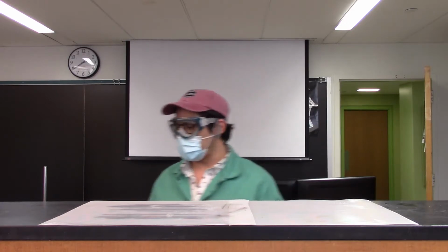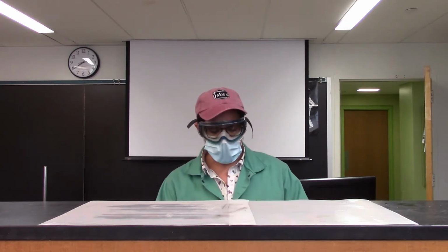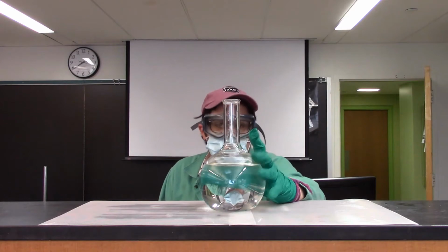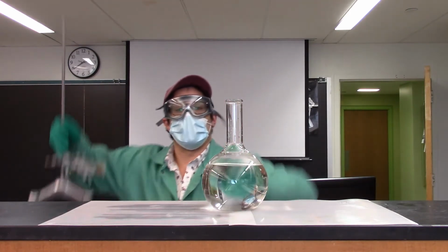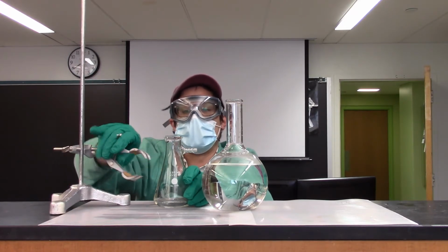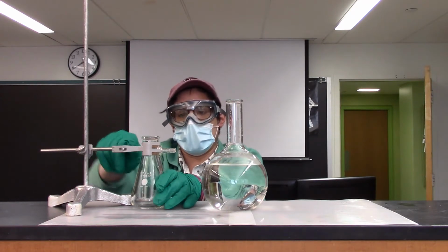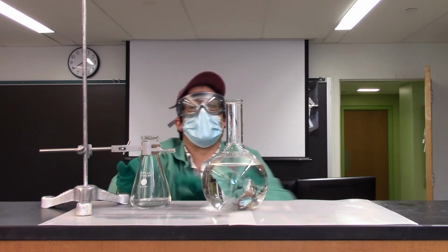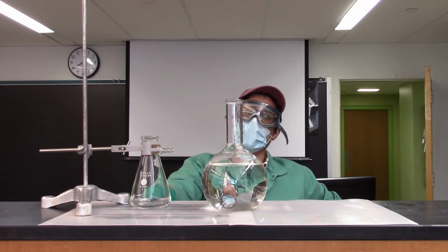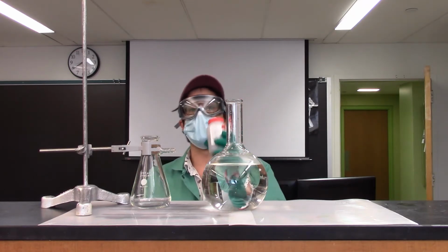So the first thing we're going to do is assemble the apparatus that we show in the laboratory. We're going to be using a 1 liter Florence flask. We're going to be using a sidearm flask, which I know you guys are very familiar with because we've been using them all semester. So I'm going to go ahead and get this clamped. This is going to be our reaction flask, where we're pipetting our 25 milliliters of our standardized hydrochloric acid and then putting in our metal to then react.